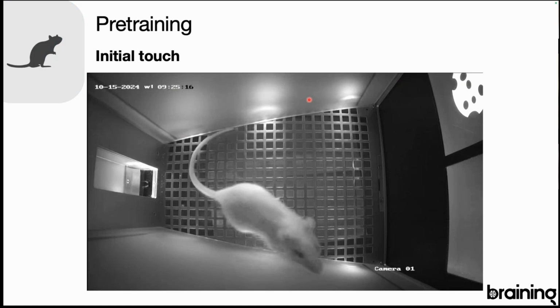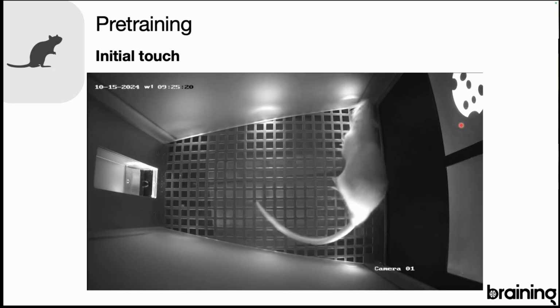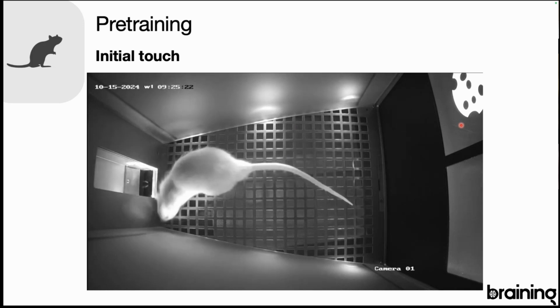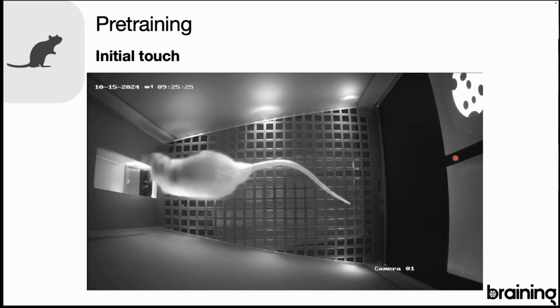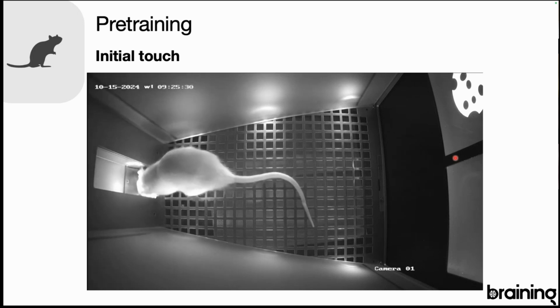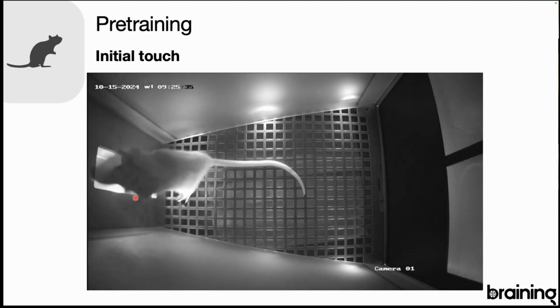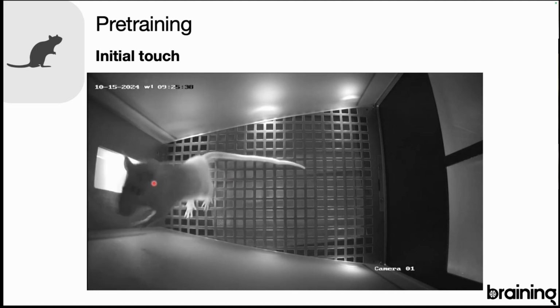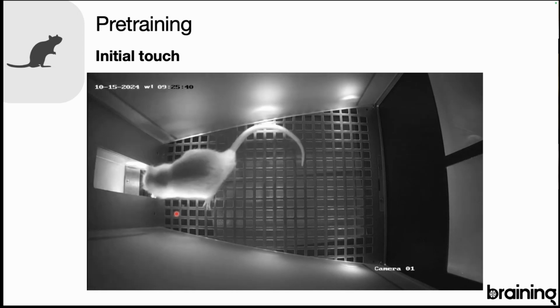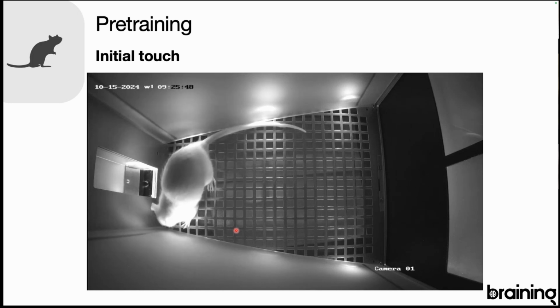It will be better visible here in the video with the rat. Here you can see that the image is displayed, but the rat is not very interested in coming near the touch screen. After the 30 seconds pass, the light in the magazine comes on and only one sugar pellet is given to the animal. It takes the reward, the light goes off, and we have the intertrial interval. In the case of rats, we set it to 10 seconds.